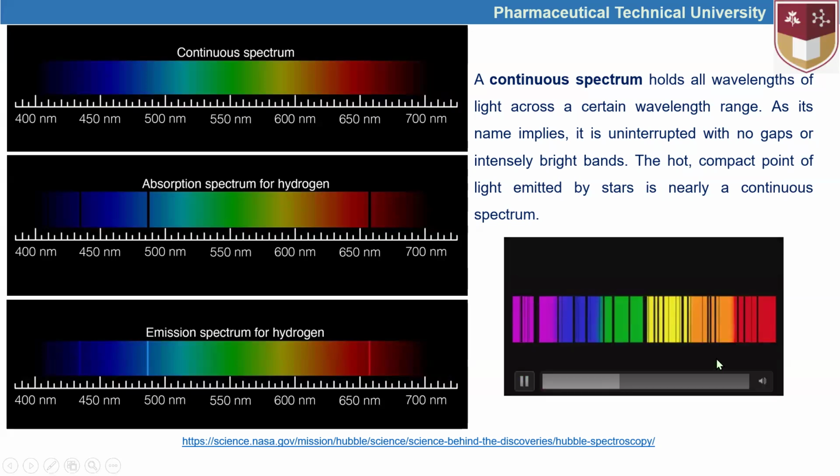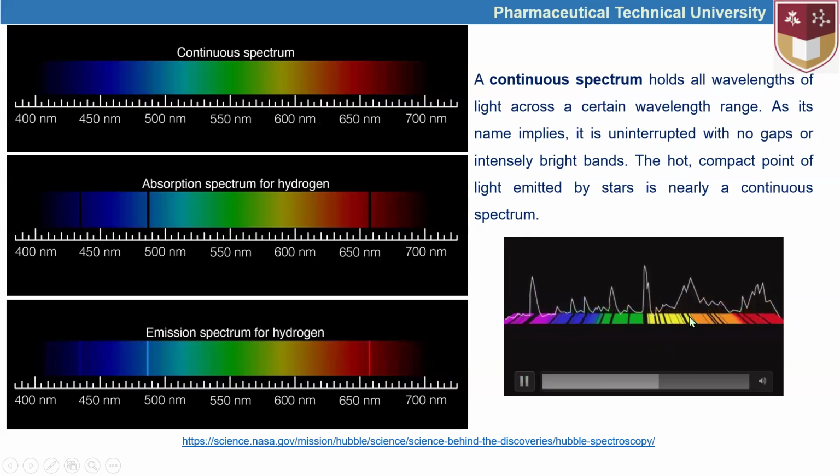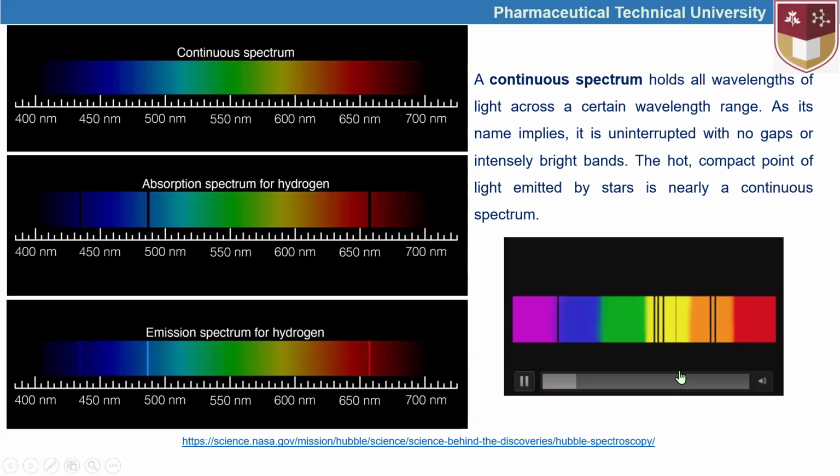So the bands are studied, and their peaks and intensities can be described like this. So by studying their bands, it will be possible to identify the presence of atoms based on their emission spectrum. Okay, next.